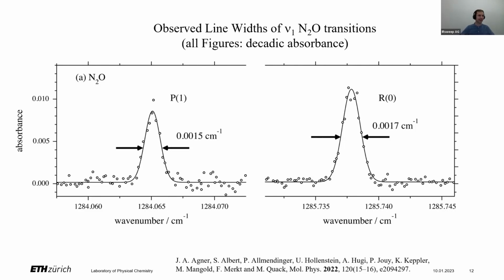And now using the slow processor that was available 2 years ago, I think those measurements took a few hours, but I also couldn't give the exact number. But that also brings us back to the announcement that I made at the beginning of the talk. With the fast processor now, those measurements would get 20 times faster.